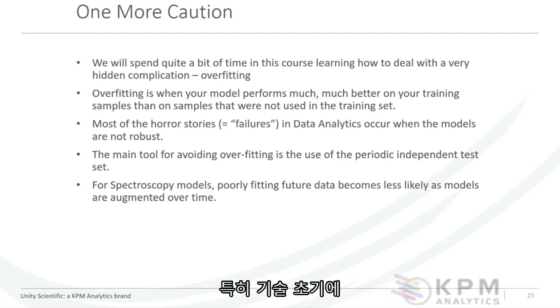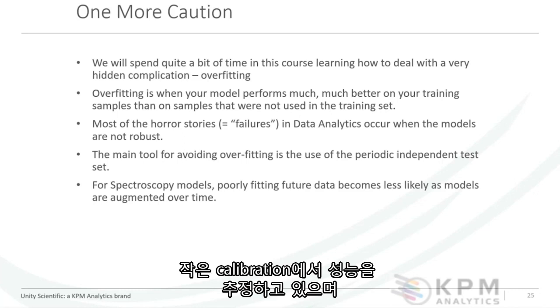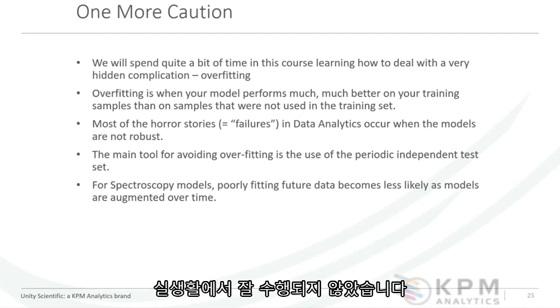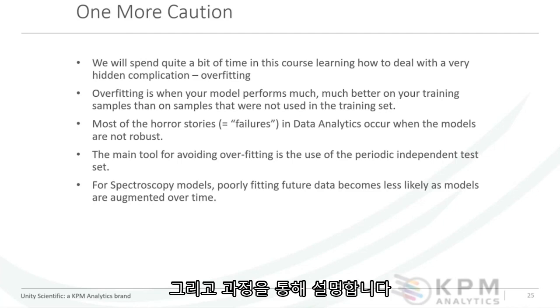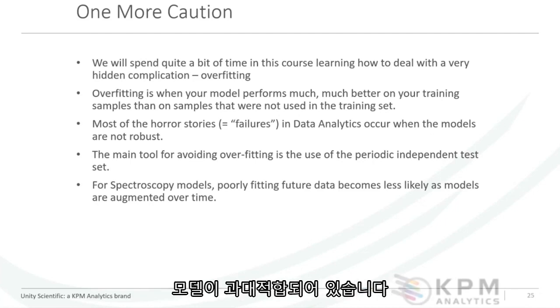And especially early in the technology, most of the negative stories that you saw were people taking a very simplified look at an analytical situation, extrapolating their performance from a very small calibration set, and it was in fact overfit and didn't perform well in real life. So we've got tools for doing this, and we'll describe that through this course, but just a note of caution. And some of the negatives you might hear about near infrared, in general, it's where people try to push too far. They aren't evaluating their models correctly, and they're overfitting. Okay.